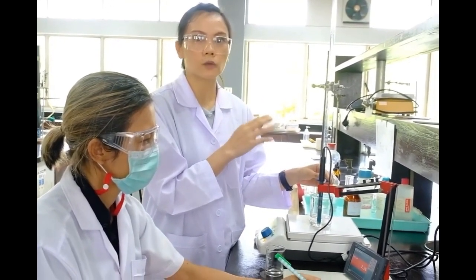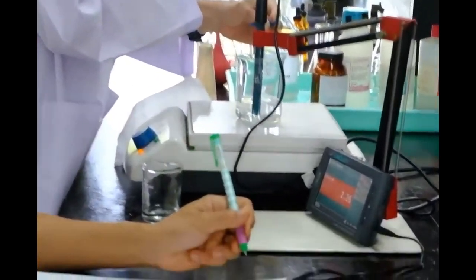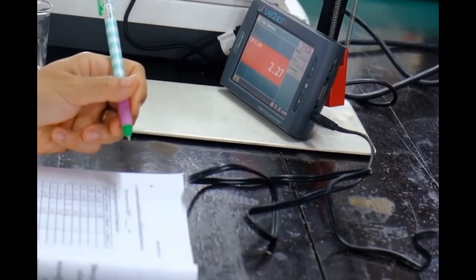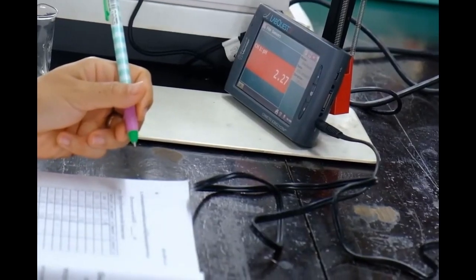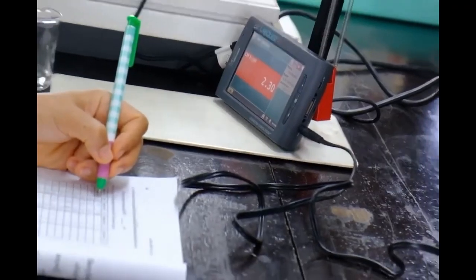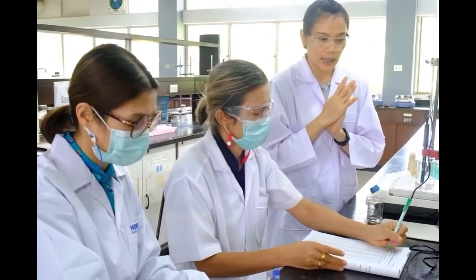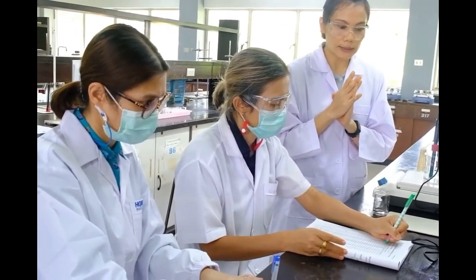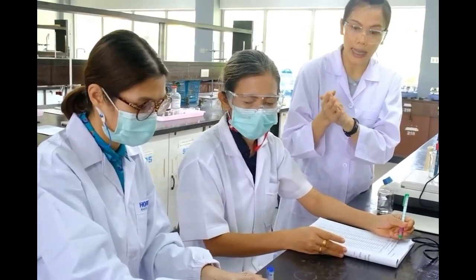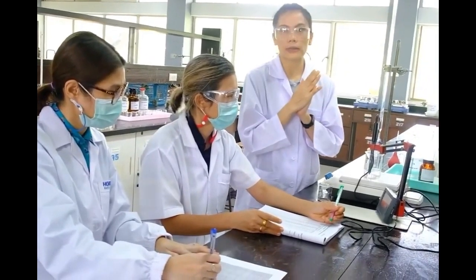Also record the reading. The student performing the plot should immediately plot the graph. In this manner, continue until 40 milliliters of sodium hydroxide is added.